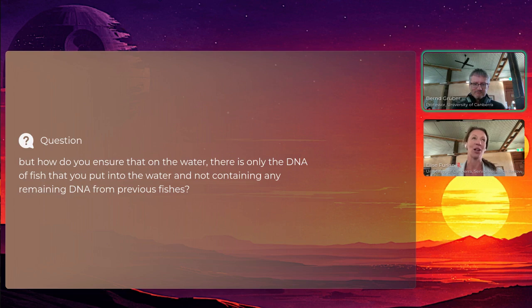So it's a bit of thinking about your study species and what they're able to handle, and what water sources you might have nearby that would be similar to the water source they exist in, but free of DNA from your target species. For the redfin blue eye, for instance, there are a bunch of nearby springs that didn't contain the species. So I was able to get water from those nearby springs that were free of redfin DNA, and then put the individual redfin blue eyes into that water.